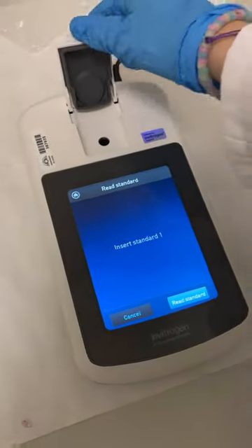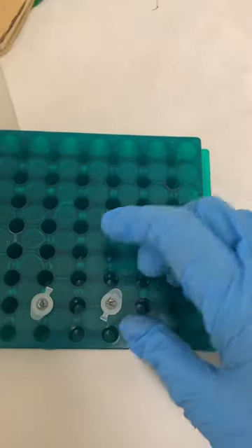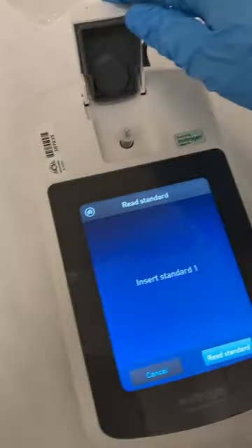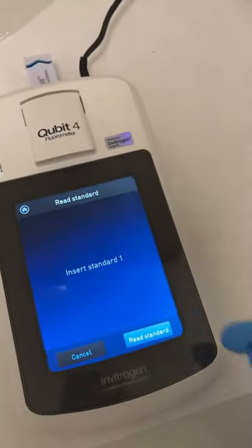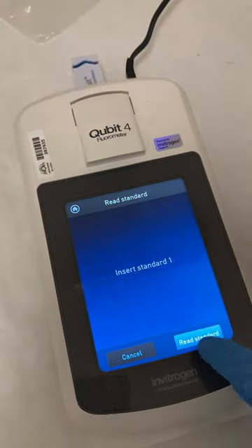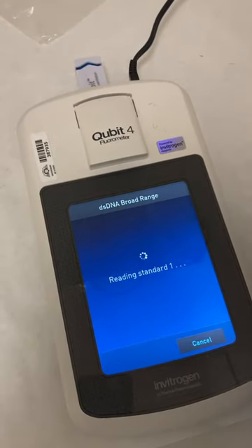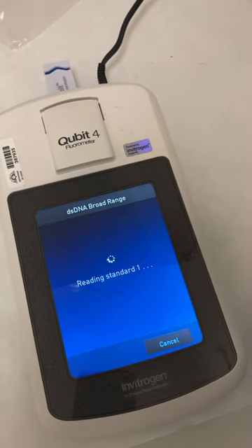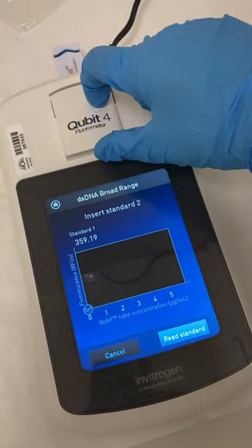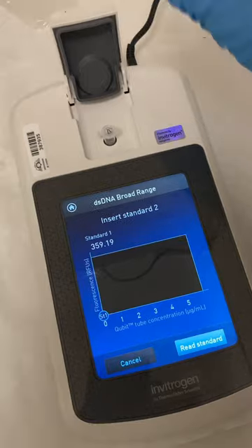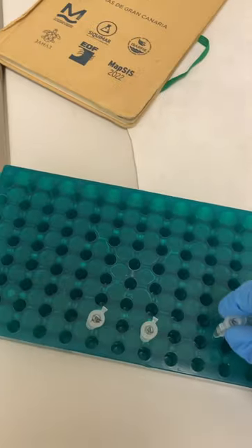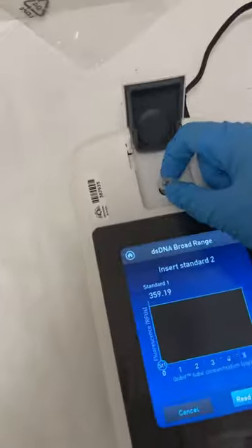We open and put our standard number one, then we close with standard one. Then we put the second standard.